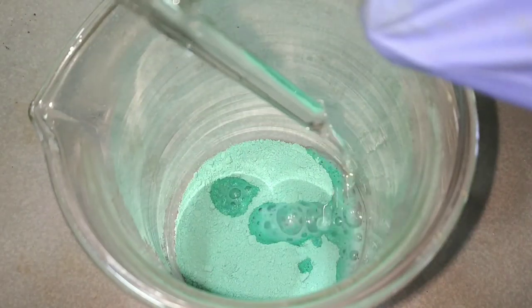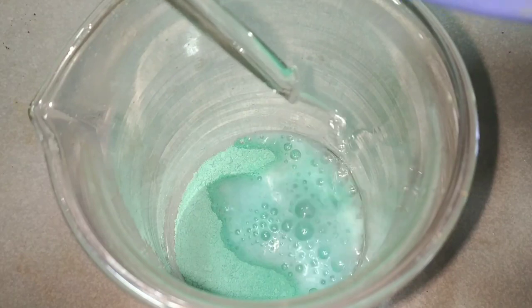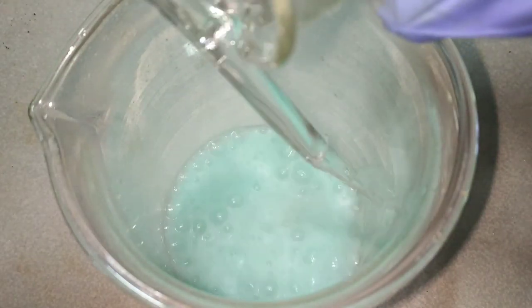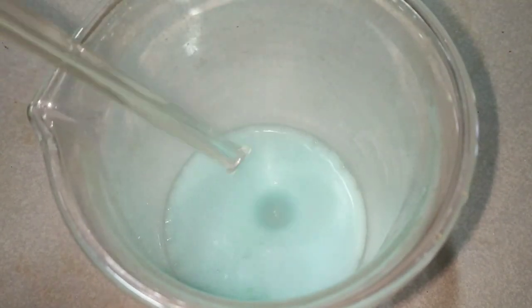We start by pouring the diluted hydrochloric acid into the copper carbonate. On adding the hydrochloric acid, we see vigorous fizzing, and that's why we add the hydrochloric acid slowly into the beaker and not all at once.